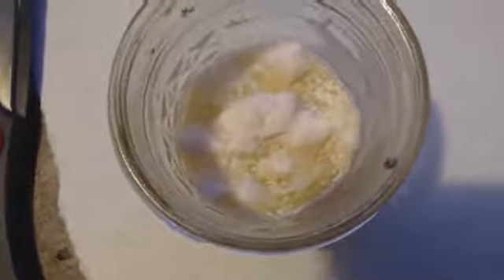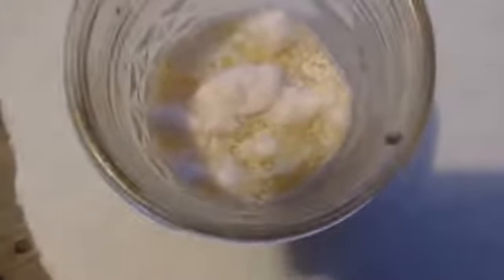Now I want you to look at this salt. This is actually like a 50-50 ratio of salt here. And you'll notice, see how my camera doesn't do it justice. But I want you to look, see how there's pink. That's manganese sulfate, manganese 2 sulfate.